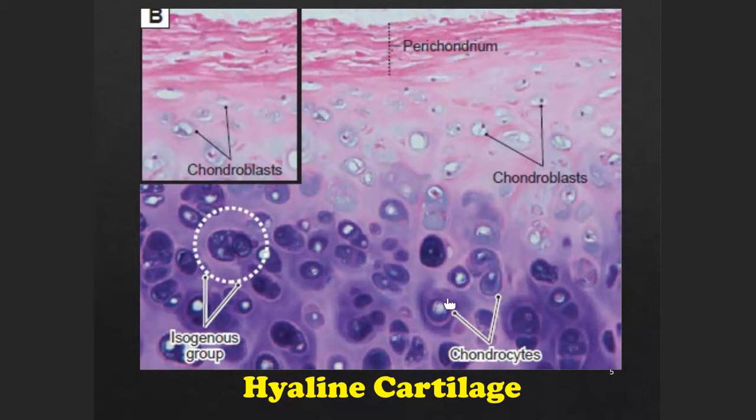Now can you see this bluish to pinkish material? These all are your matrix, and they help in the formation and maintaining of the cartilage, and the cartilage vitality through these cells. So these all are the matrix. Understood? Okay. Others also can say yes.